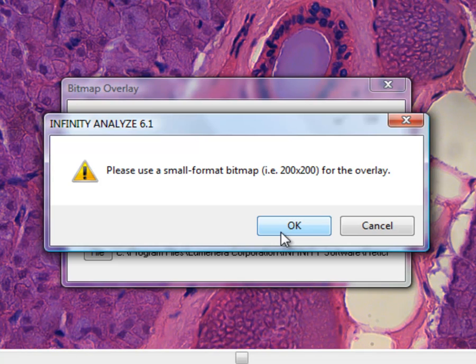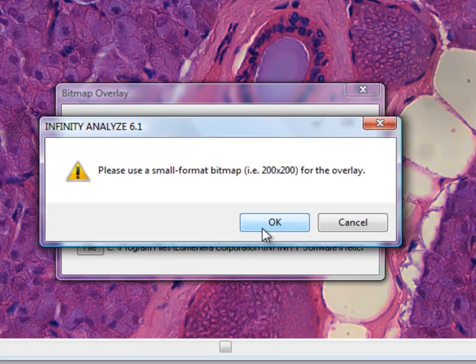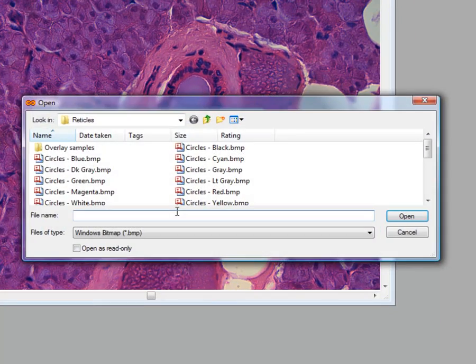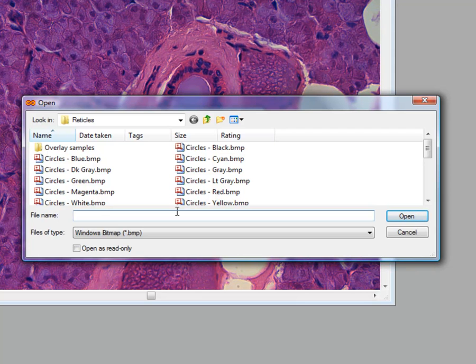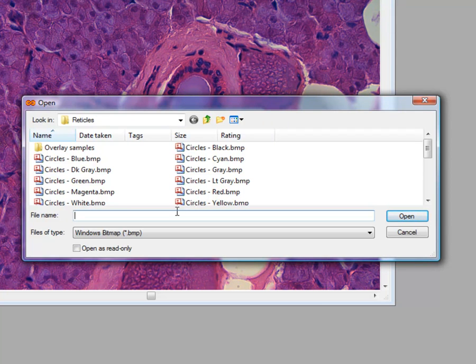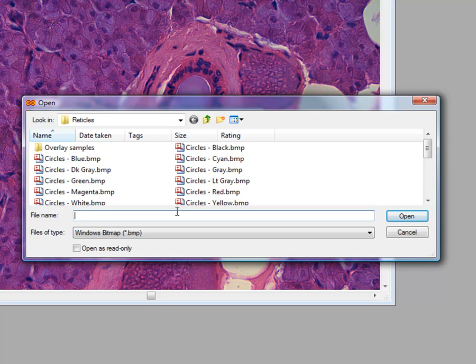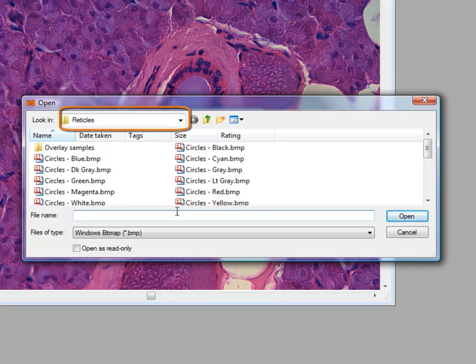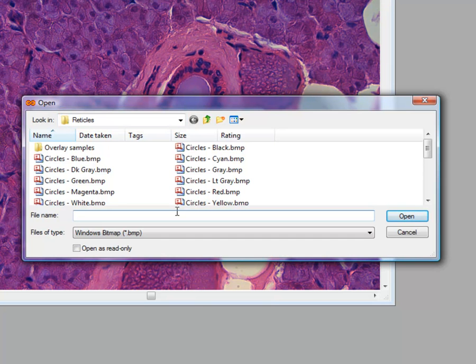Most newer computers can cope with a bitmap that is larger than the recommended dimensions, up to the resolution of the sensor for many camera models. A standard Microsoft file access window appears to navigate to a location where bitmap files are located. These can be located in any convenient location, but Luminera includes several sample bitmaps in a folder called Reticles, found where the Infinity software is installed on your computer.